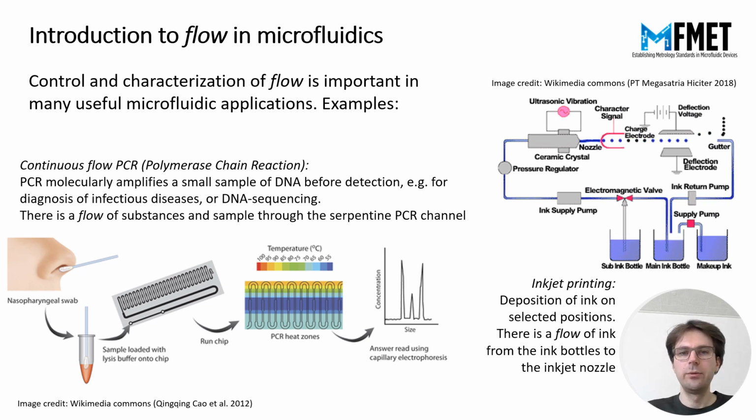Flow is a very important quantity in microfluidics. And to introduce flow, I would like to present two examples of microfluidic applications that use flow. These examples are in themselves quite complex, so one could talk for a long time about all the details of the applications and how they work, but we will not do that here. I will just give a very brief presentation and say that they exist and how there is microfluidic flow in them.